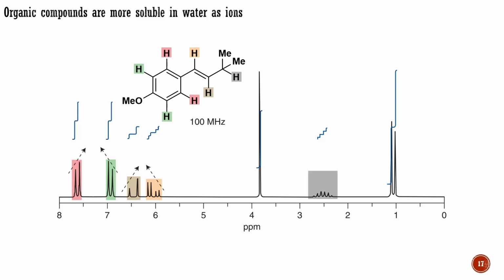The distant allylic proton is part of an isopropyl group and is coupled to the alkene proton underlined in orange and the 6 identical methyl protons. Both coupling constants are nearly the same, so it is split by 7 protons and is an octuplet. It looks like a sextuplet because the difference between the intensity ratios of the lines in an octuplet is exceedingly large, so it is not surprising that the outside lines of the octuplet are hardly visible.